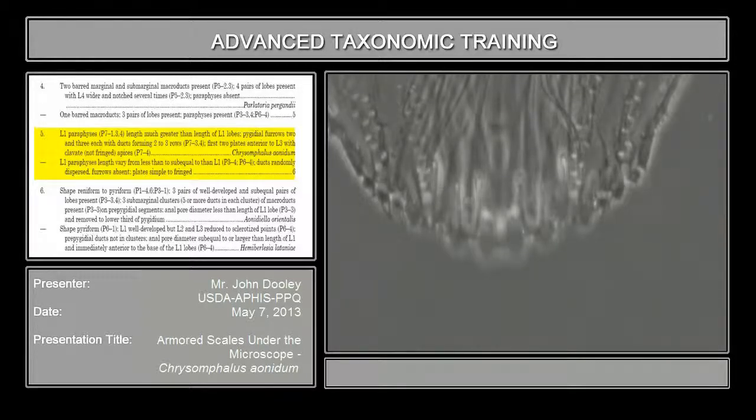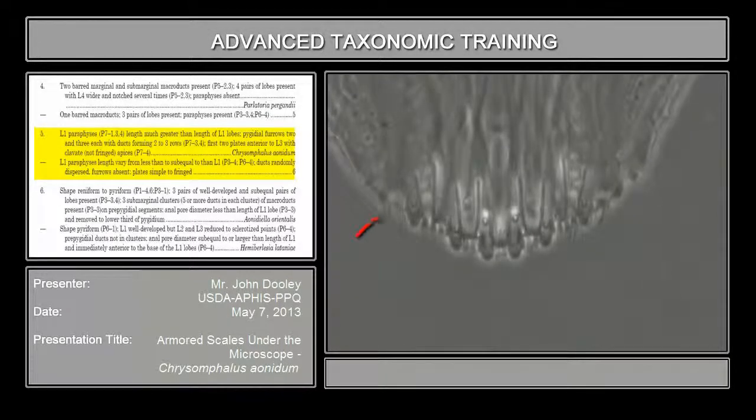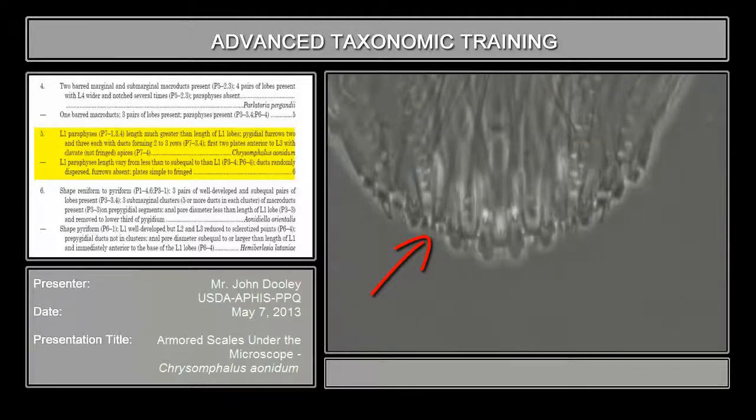And on this particular species, the plates are various. See how the plate here — this is the best example — how it forms like two big teeth? It's like a claw, whereas these plates are all fringed. See how these plates are fringed? But this one only has two big claws — pincers. This genus — this species of this genus — the plate beyond the third lobe, and sometimes the third plate beyond the third lobe, forms this. Other species will form a club. Other species besides those two will also form a fringed plate for that plate.